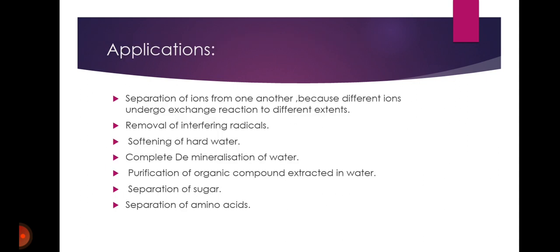What are the applications of ion exchange chromatography? Separation of ions from one another, because different ions undergo exchange reactions to different extents; removal of interfering radicals; softening of hard water; complete demineralization of water; purification of organic compounds extracted in water; separation of sugars; and separation of amino acids.